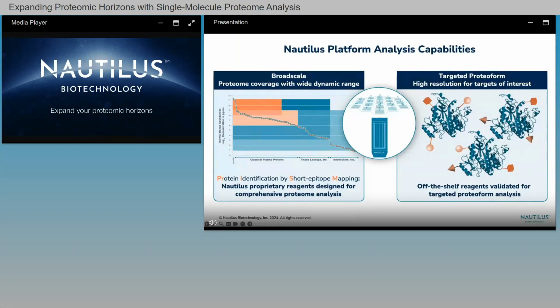The difference is simply what types of affinity reagents we use to probe the sample. For the discovery mode, we use a novel class of affinity reagents, which we call multi-affinity probes, as shown here on the left. For targeted applications, we use the same platform, but switch to site-specific and target-specific probes, often that are commercially available.